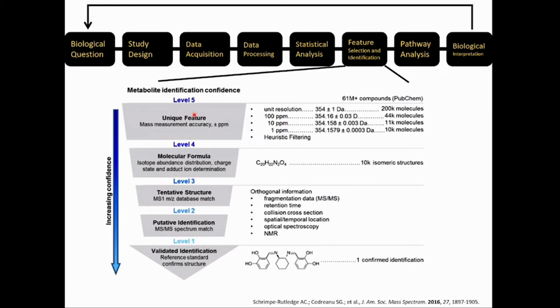The problem with that is that the answer is not unique. There's many metabolites with a similar molecular weight that correspond to different structures. And then you can start looking at other things like the distribution of the isotopes in the envelope. And you can do an experiment called an MS2, a fragmentation experiment, where you take the molecule and break it apart. That is done inside of the mass spectrometer. And by measuring the size and the shape of these parts, you can put the structure together. And in that case, the annotation is much more confident and you can tell what the metabolite is.